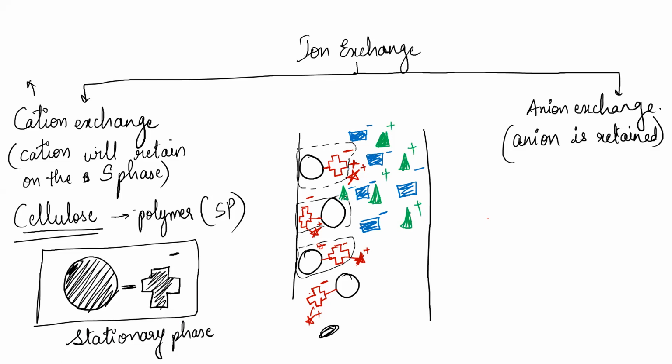So suppose now what is going to happen, this mobile phase that you're running through is now containing your analytes also. So the mobile phase is going to interact with the stationary phase. I'm now only drawing an individual reaction.